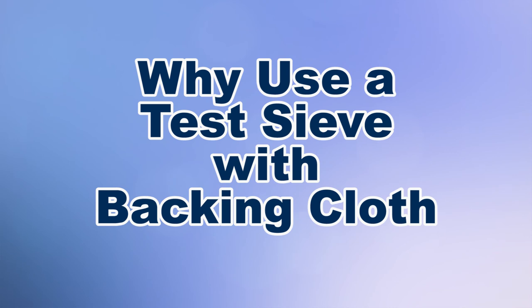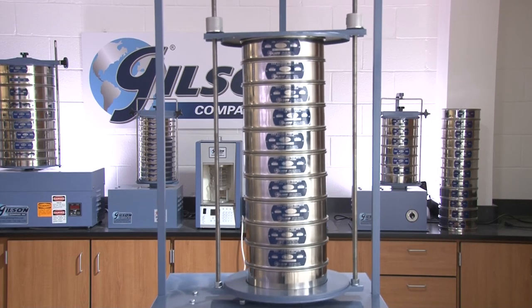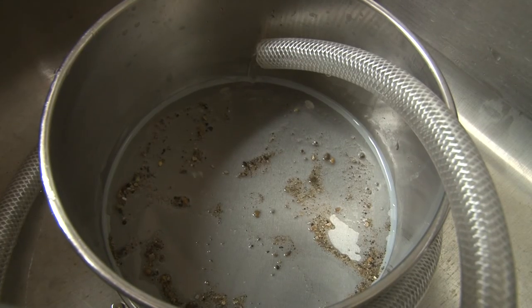By a wide margin, test sieving is the most simple, efficient, and cost-effective means for particle size determination of a wide range of materials.